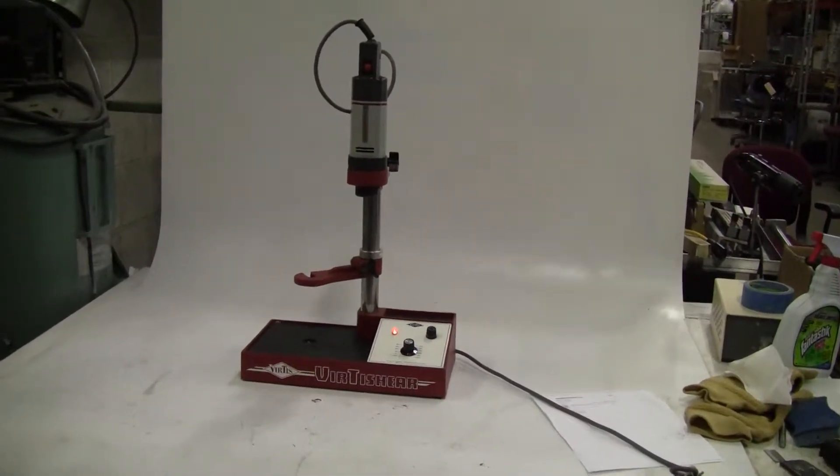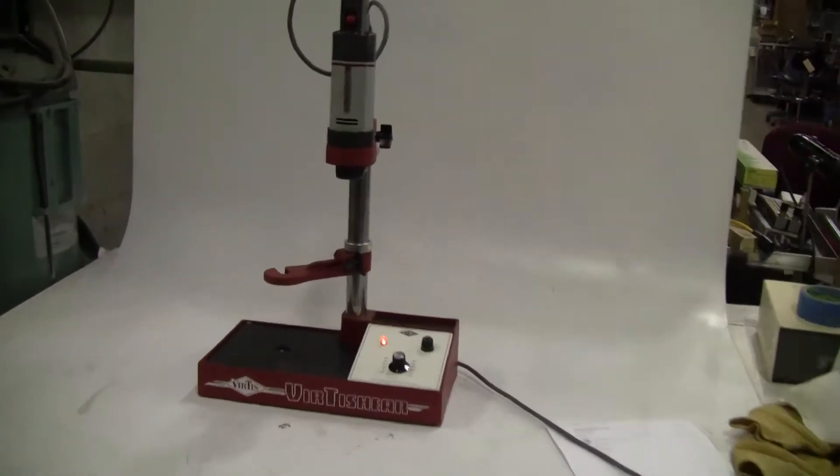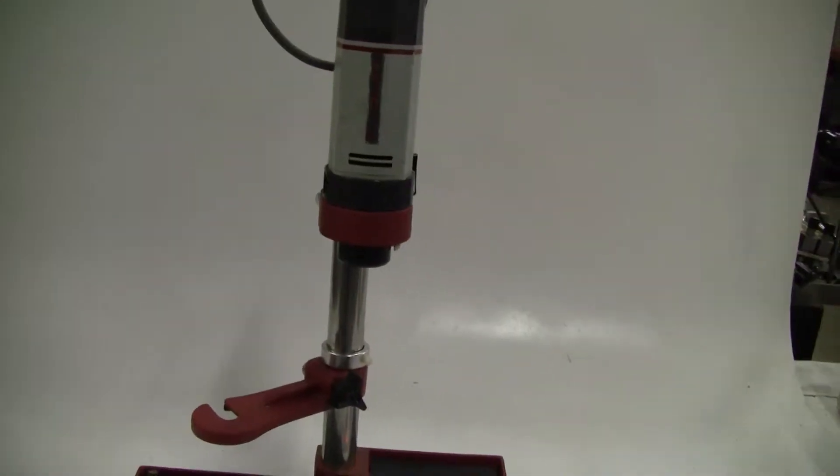Hi, this is Jim from HitechTrader. We have a Virtus Shear Lab Homogenizer. It is variable speed. We currently do not have a stator, but we can probably come up with one.